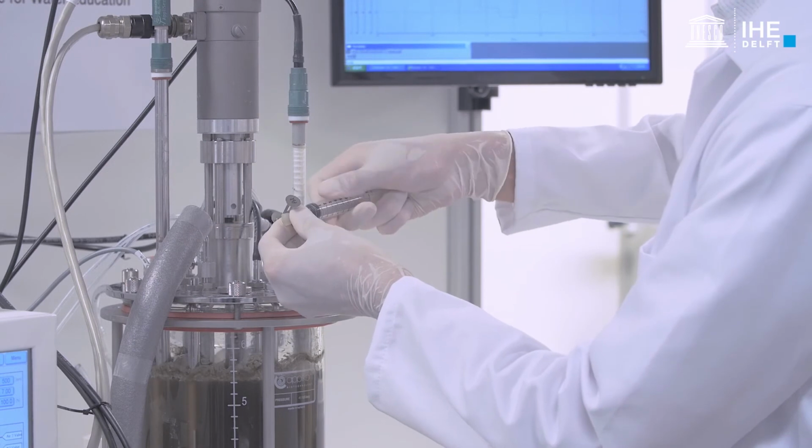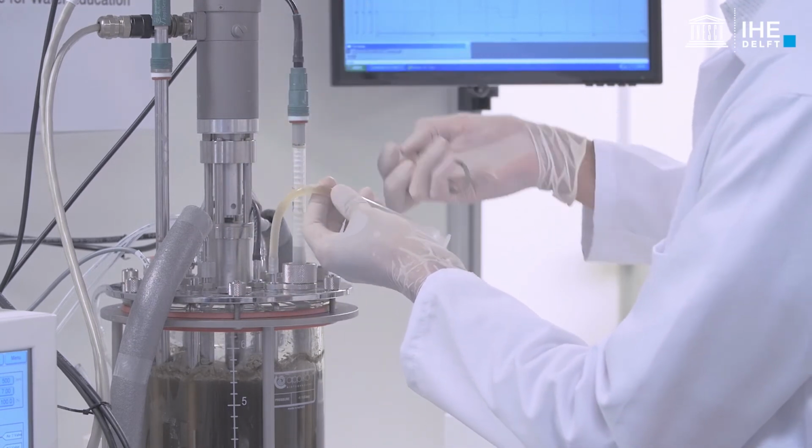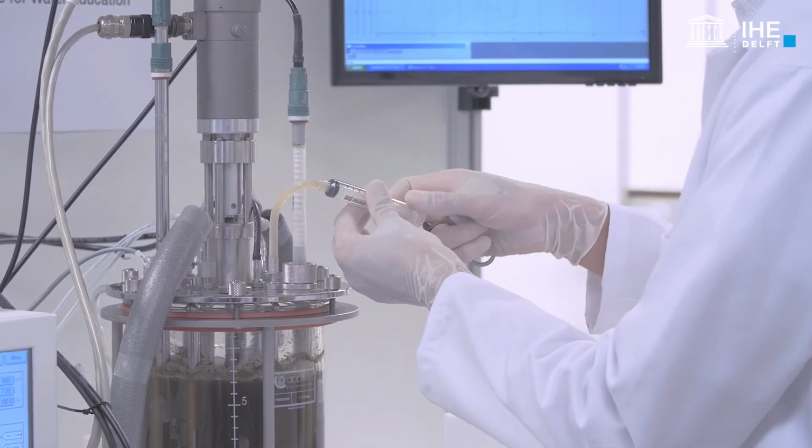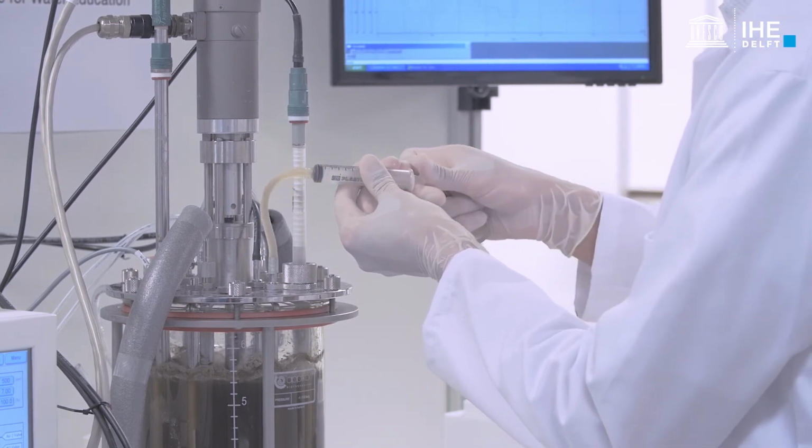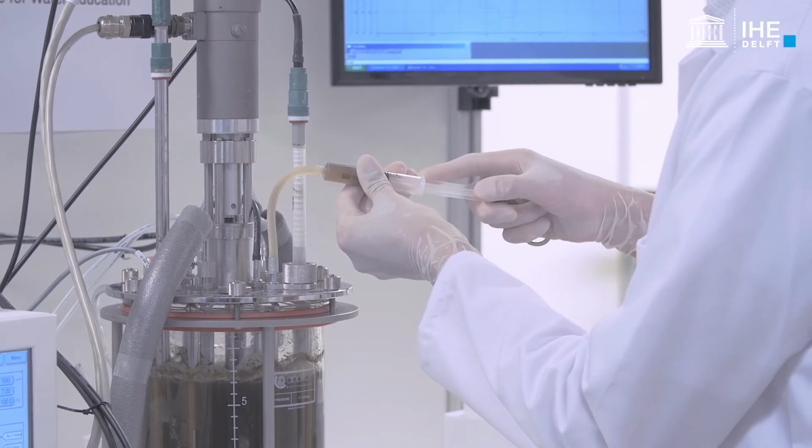It is important to filter the samples at the corresponding sampling time. Thus, start with the collection of the samples around 20 seconds before the time indicated in the working sheet.